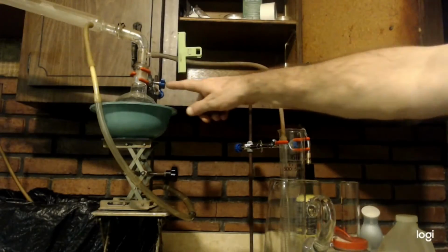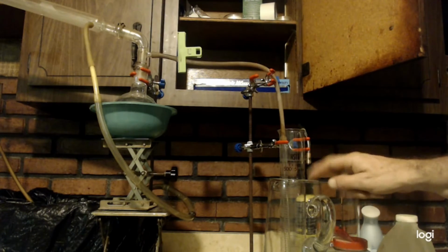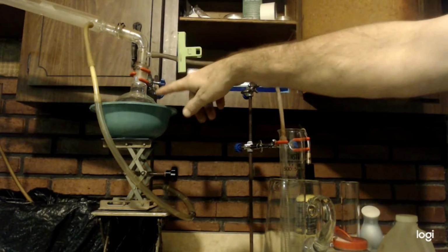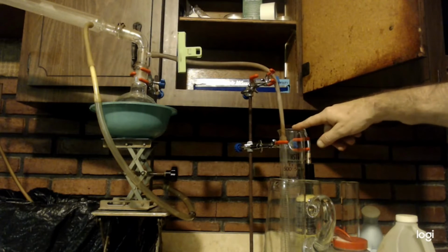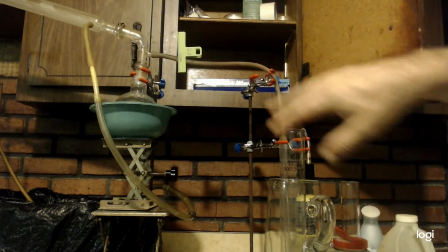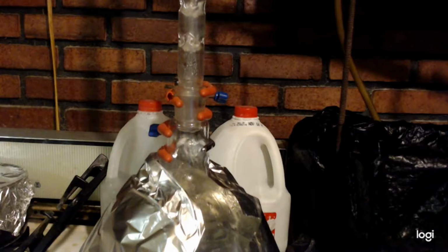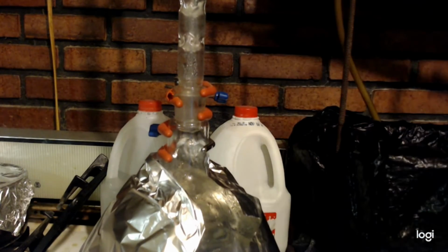Also, this receiving flask actually acts as a suckback trap. So if this gets sucked back all the way up in here, this round bottom flask is 500 milliliters, and this is 500 milliliters, and I'm not even going to fill it up that high. So it can definitely take the suck back, and if anything gets distilled over, it can be caught in there. Well, it took a while, but it's almost boiling. You can see it's starting to reflux a little bit.